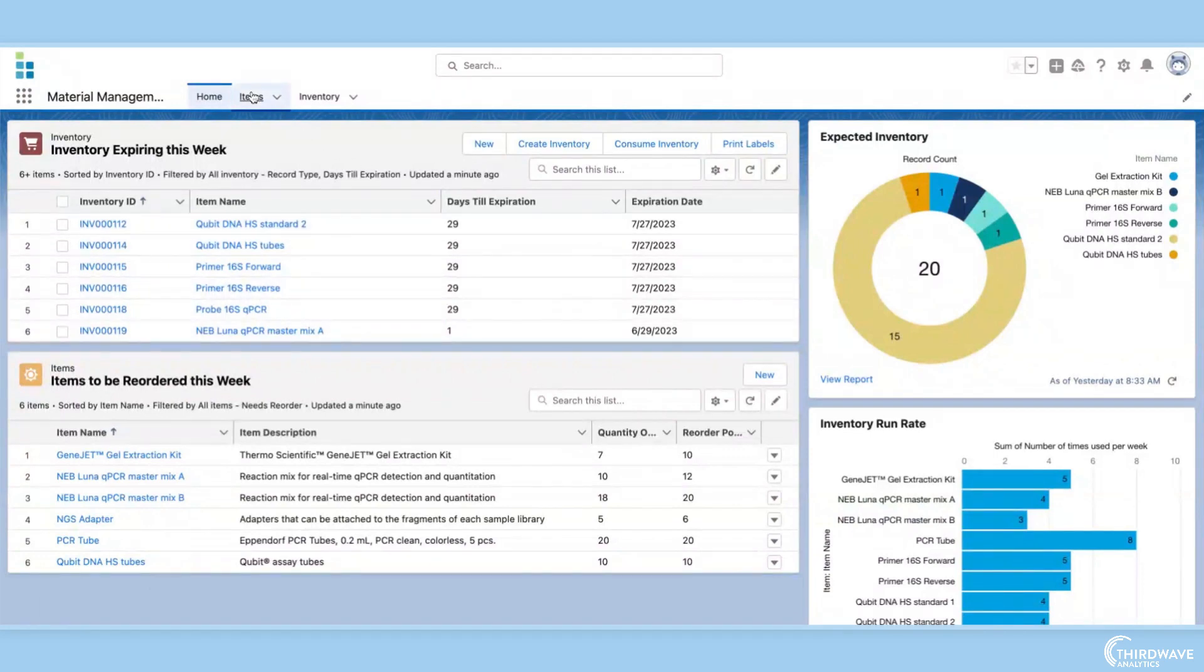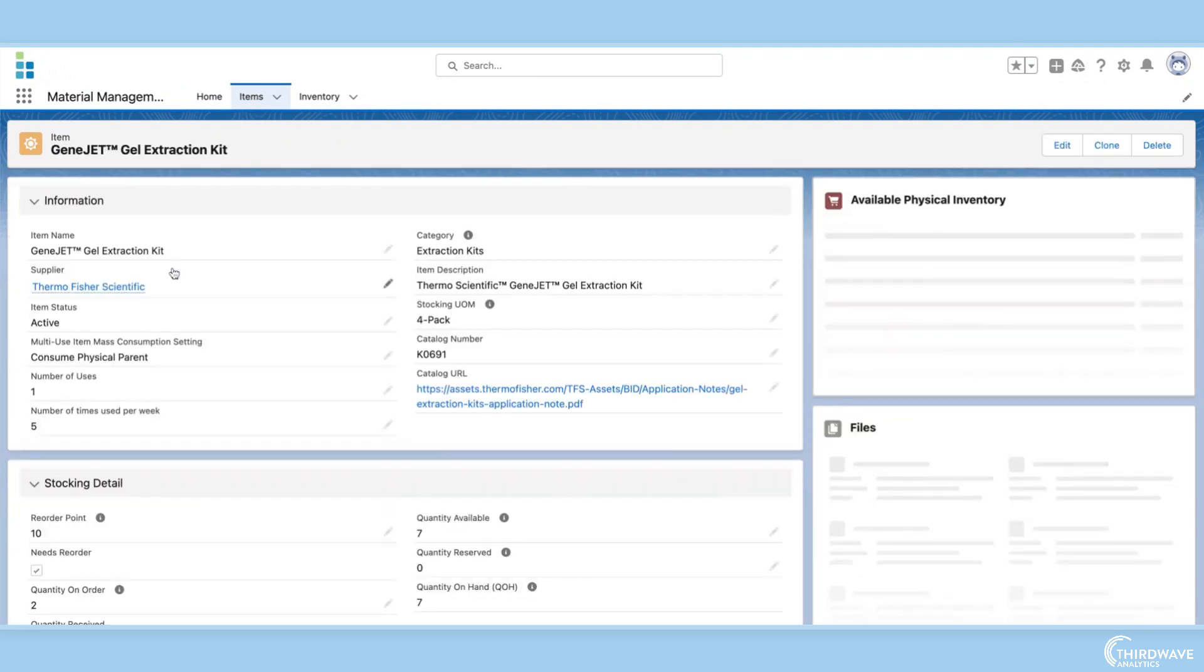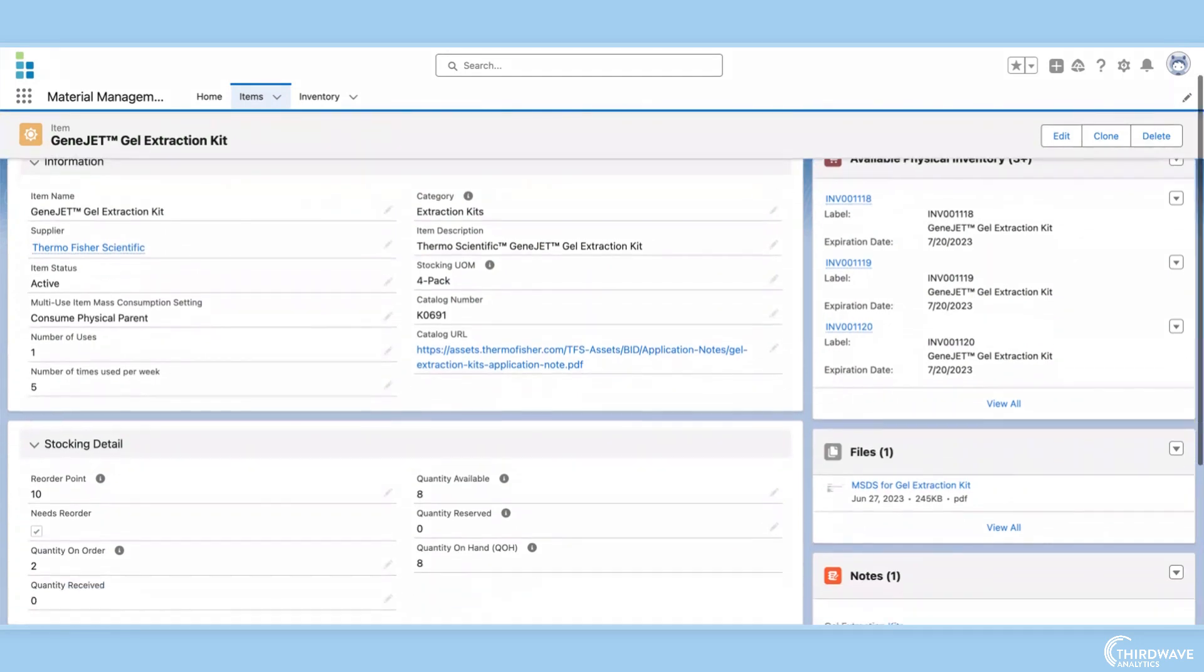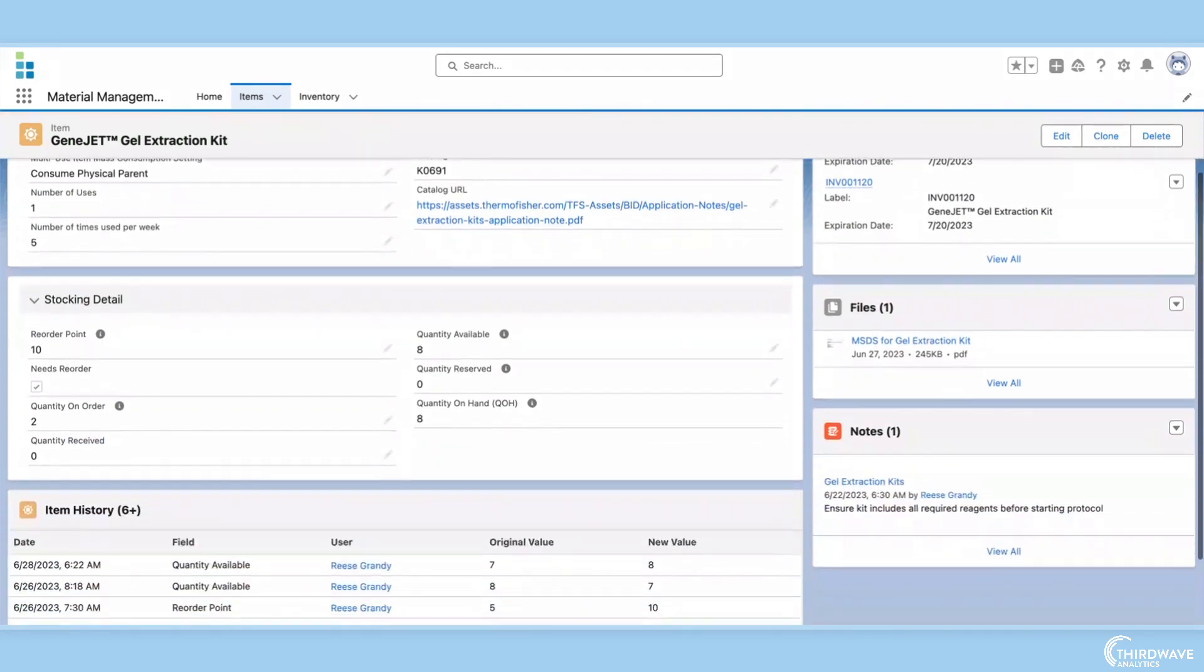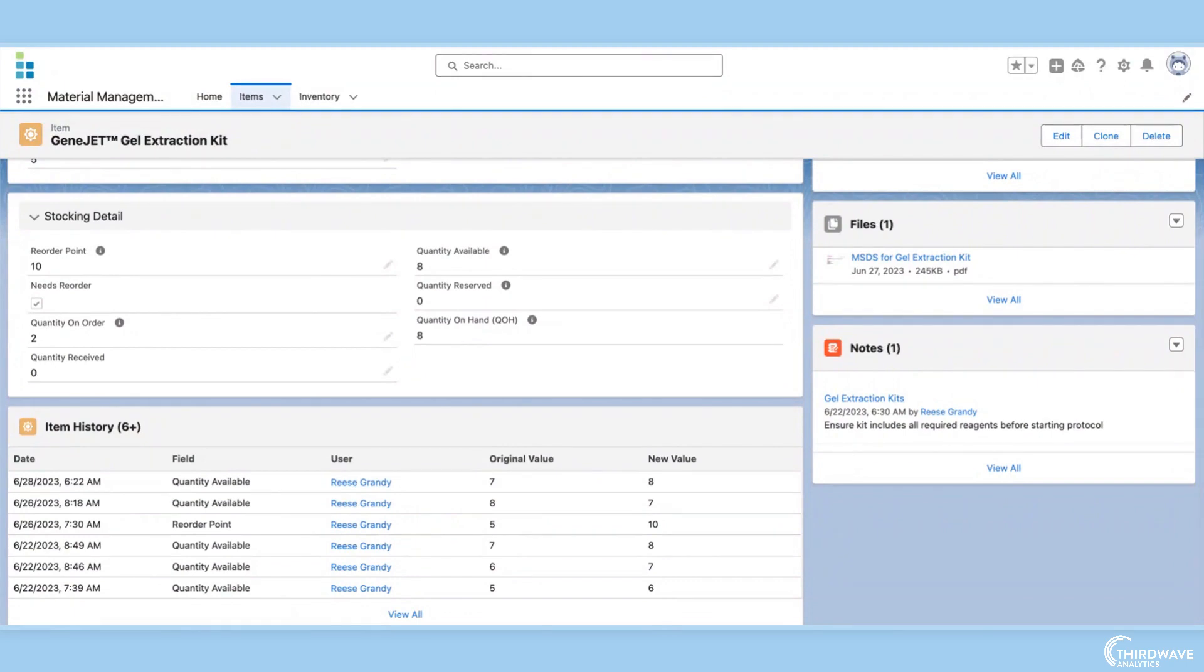From here, we can click the items tab and select an item record. In Lockbox, an item record tells the user information about the material, from its name and description to the supplier and catalog number. You can think of this as the catalog master record for the material.